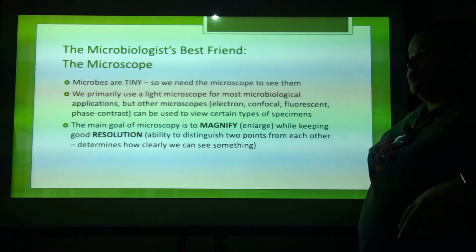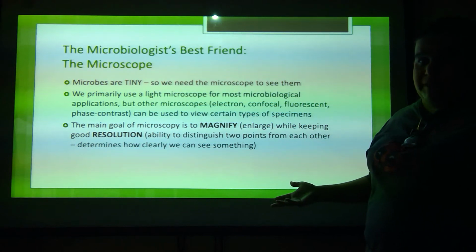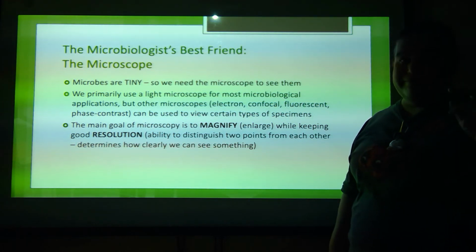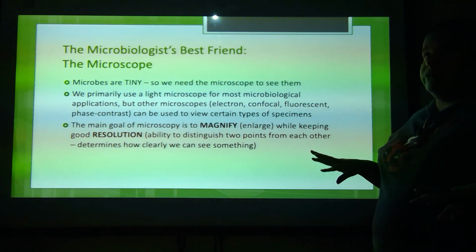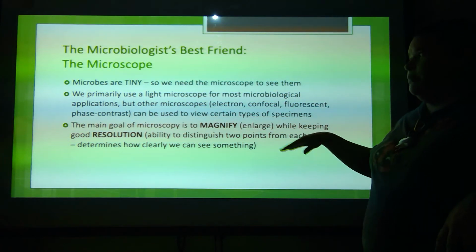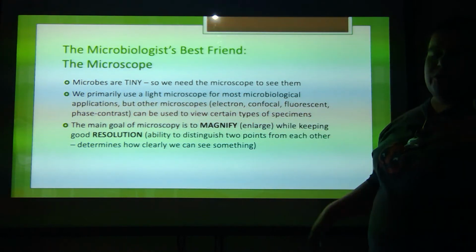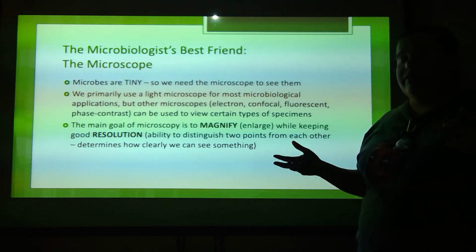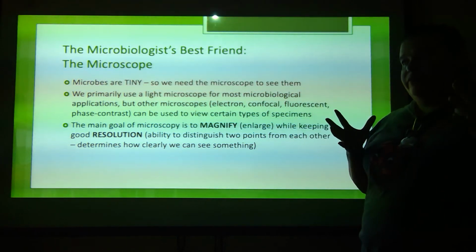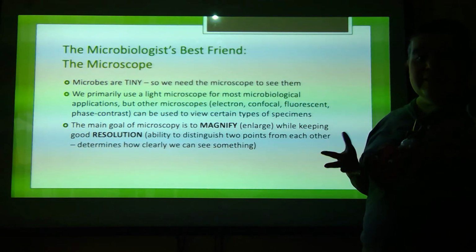We primarily use the light microscope for most of our microbial applications. But there are other types of microscopes: electron microscopes, confocal microscopes, fluorescent microscopes, phase contrast microscopes. There are a variety of them, but the standard for most colleges anyway is the light microscope.